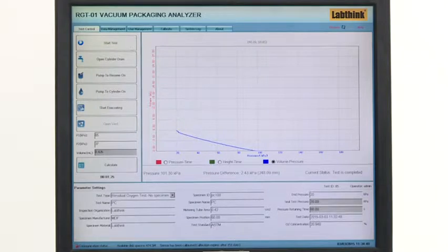Click to check volume pressure curve and determine a smooth and even section in the curve. Input P1 value as the initial point, that is, higher pressure value point. And input P2 value as the end point, that is, lower pressure value point.